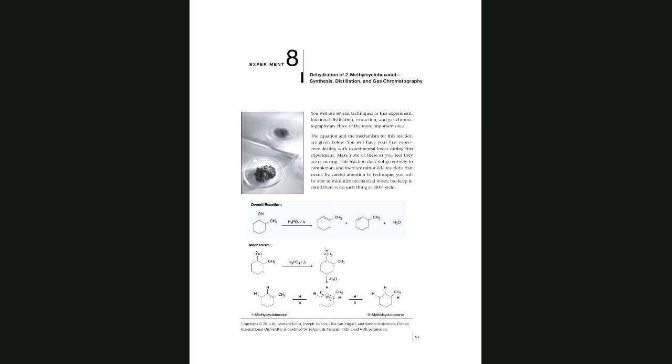Please tell me what is missing. The vacuum adapter is going to connect the condenser to the receiving flask.